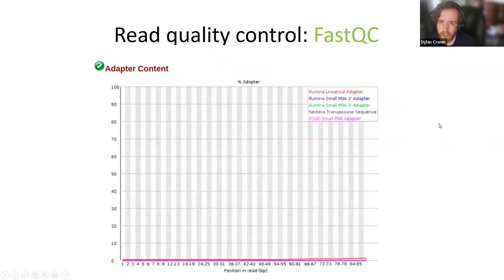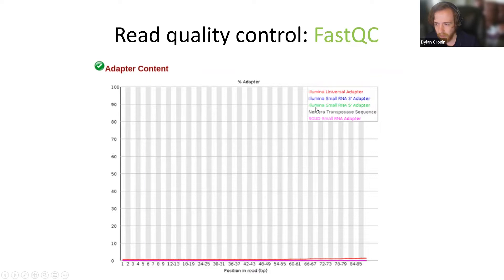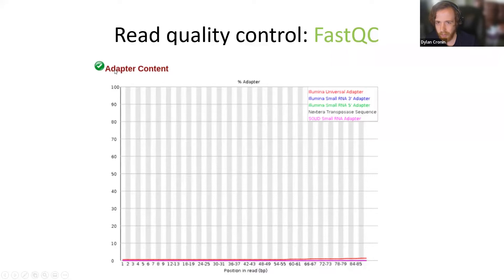Another very useful feature of FastQC is that it looks for adapter content in your sequences. In this case it's not detecting any, giving a green checkmark. It looks for Illumina, Nextera, and SOLiD adapters and will throw a warning if it sees them, especially within the first few bases. This is one of the most important things to check — make sure you're removing adapters because those are not the biological sequences we actually care about.